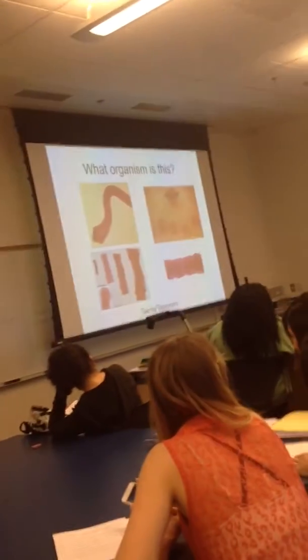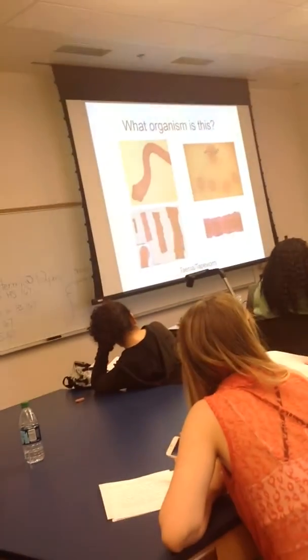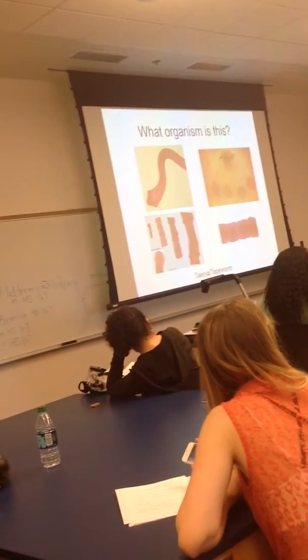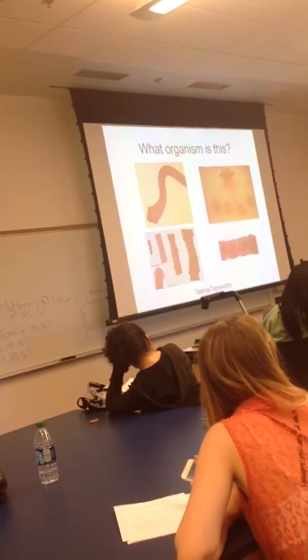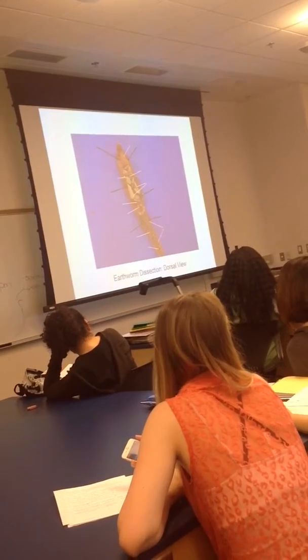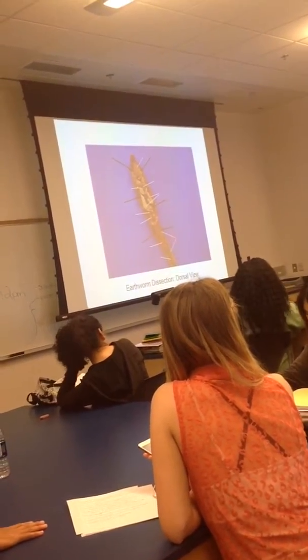So it was the only segmented flatworm that we looked at. All right, that's it for slide organisms.